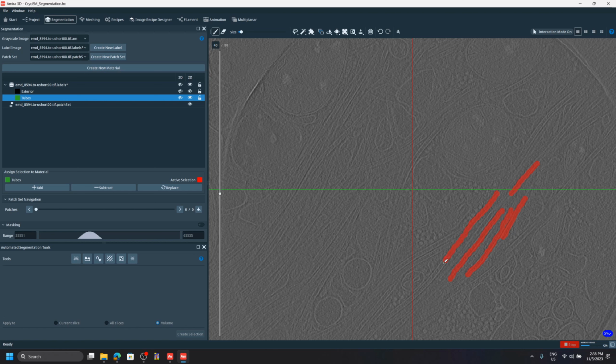And obviously, the better your manual segmentation is, the better the results of the AI segmentation. And it's obviously difficult with the mouse, right? To help with this, we actually have a pen and tablet interface in the VisLab as well. You can book that when you book the Vive machine. It's attached to it. And I'll show a video of that later. So anyway, let's try this.